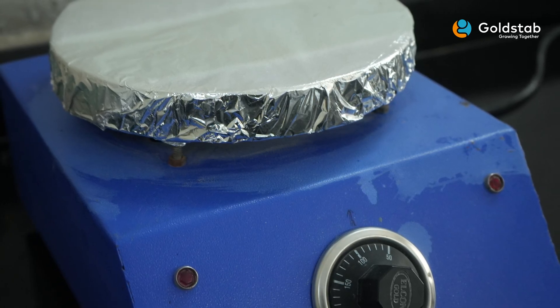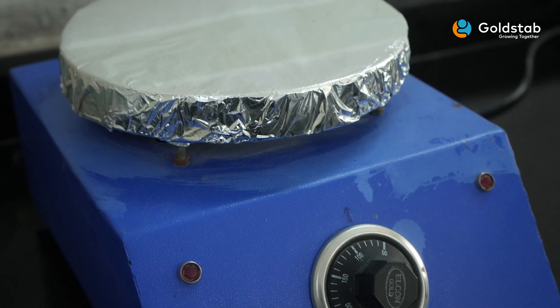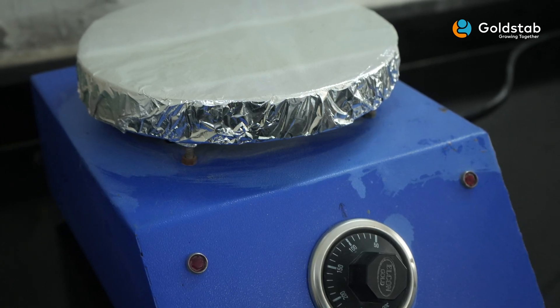Ensuring its quality is essential for obtaining the best performance in any application. We will use a very simple and quick method to check the purity of zinc stearate. By following these simple steps, you can determine the quality of zinc stearate accurately.